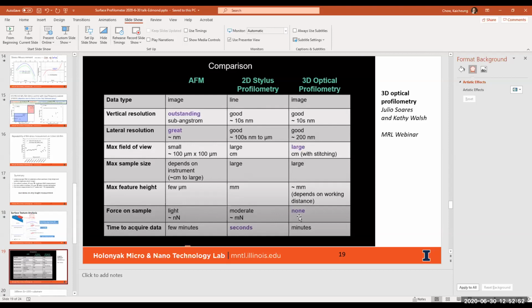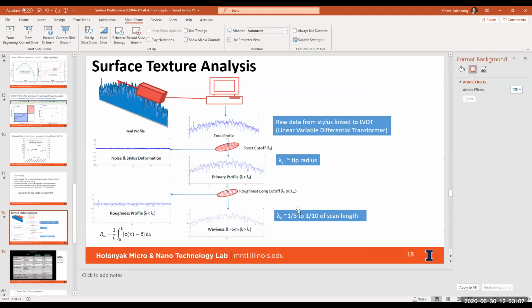In your use, have you seen anything left over so that sample measurements change as you do them? No, I have not seen anything left, and it's fairly easy to clean the stylus.